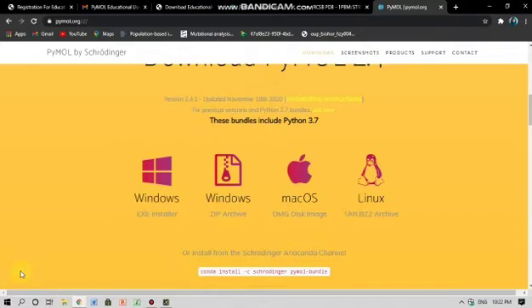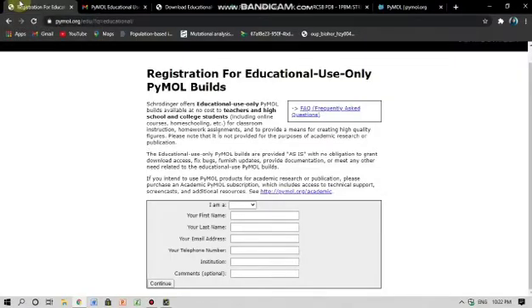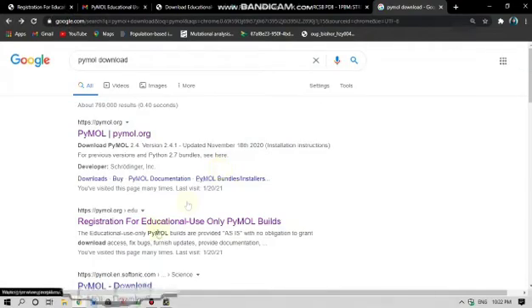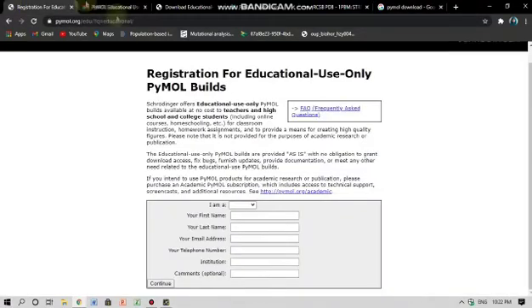In the meanwhile I'm going to register for this software to get the license file. So I will go to the registration form link by going back and clicking on the second hit. Such kind of interface will appear. I will write down all the credentials here.